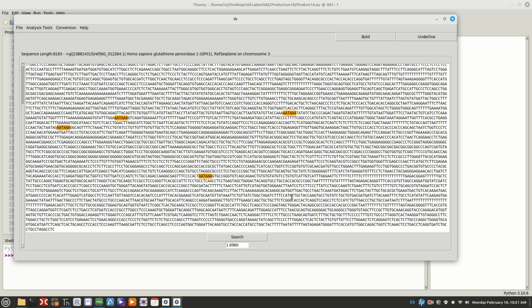You could just take out everything, go to about 1,000 after it. I mean, it always could be further away. They can be quite a bit. So go from about right here back up to your polyadenylation. Control C and Control V, make you a new FASTA, and just look for that on a smaller sequence. That way you don't have to worry about all the gunk around and searching around like we were doing.